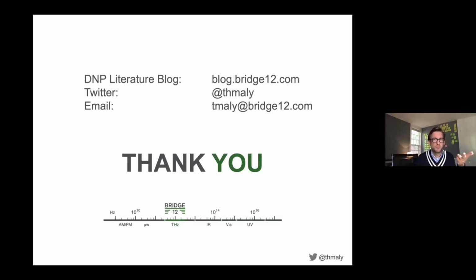That's the great thing with the Gyrotron. The Gyrotron has a beam that goes through an overmoded cavity, and once everything is aligned, this thing is going to work, maybe not forever, but close to forever. And there are no issues over time of the actual Gyrotron tube. Yes, there can always be a power supply breaking or the cooling water not running or something like this. But TWTs have limited lifetimes. Unless there's something wrong with the Gyrotron, it will work for a long time.